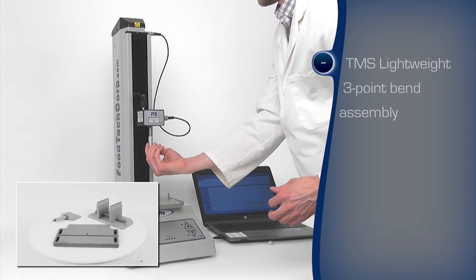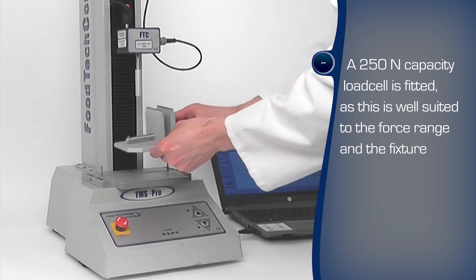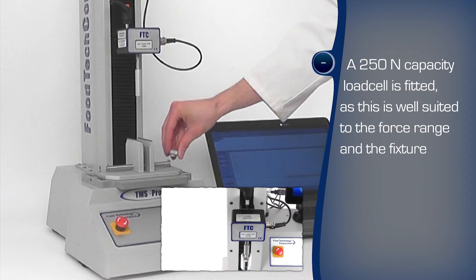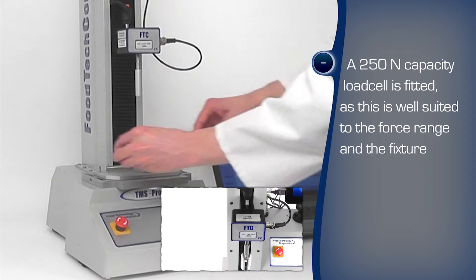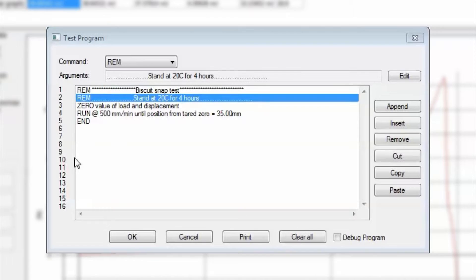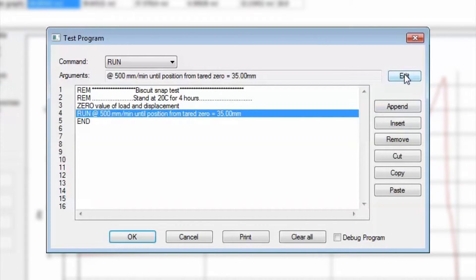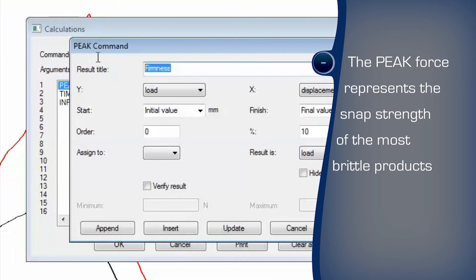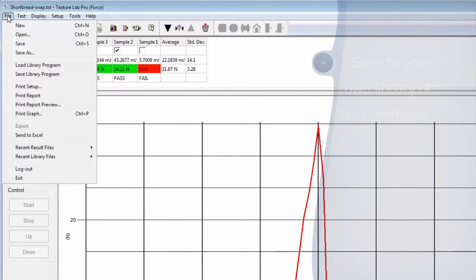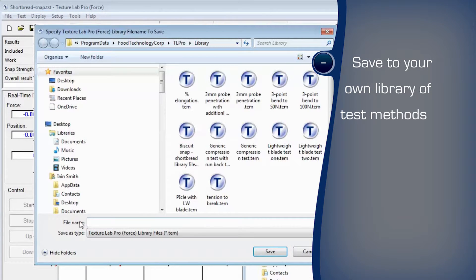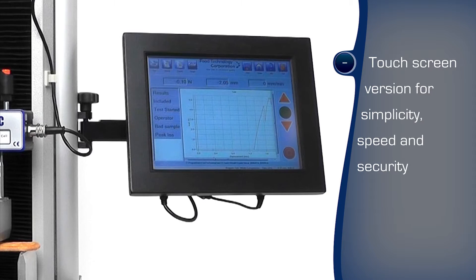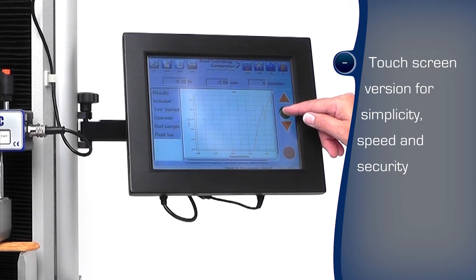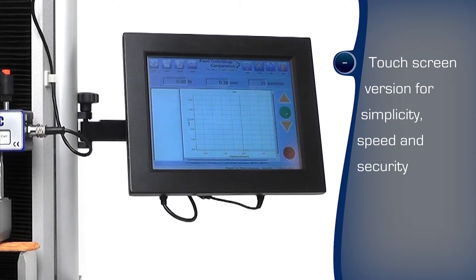The texture analyzer is fitted with the TMS lightweight three-point bend fixture and a suitably rated load cell is used to maximize measurement accuracy. The automated test program is easily written within the familiar Windows-based environment. The commands are selected to perform the steps, the shortbread snap strength is calculated from the peak force and the work is measured from the area under the resulting curve. The program can be saved to a library and recalled for reuse. The touchscreen-controlled texture analyzer runs tests at the push of a button with minimal training, ideal for production areas.